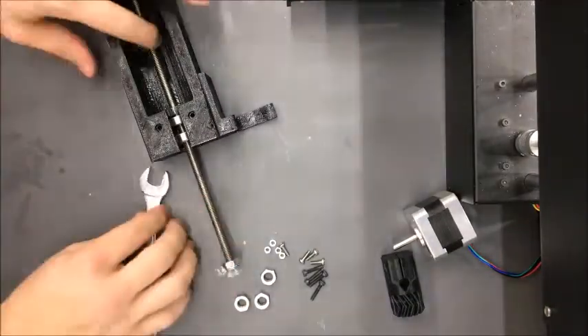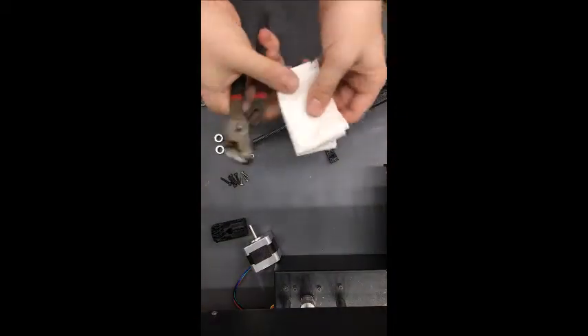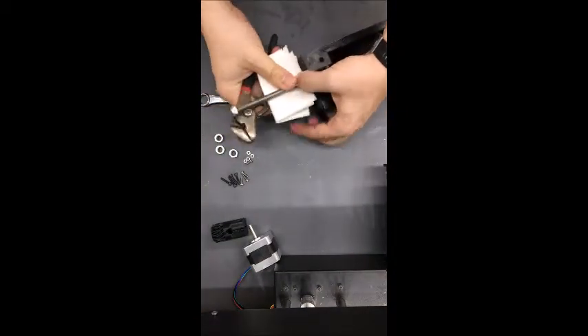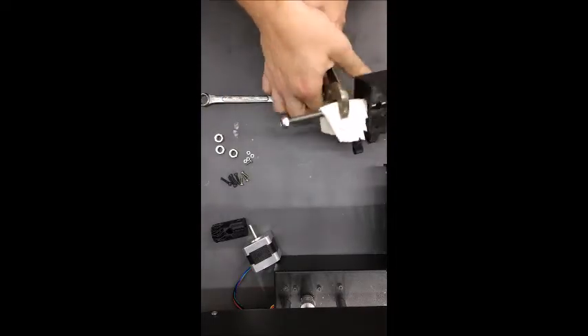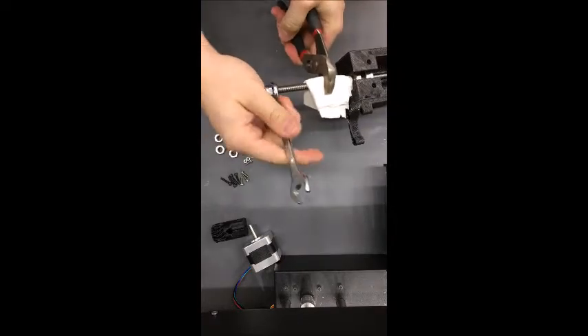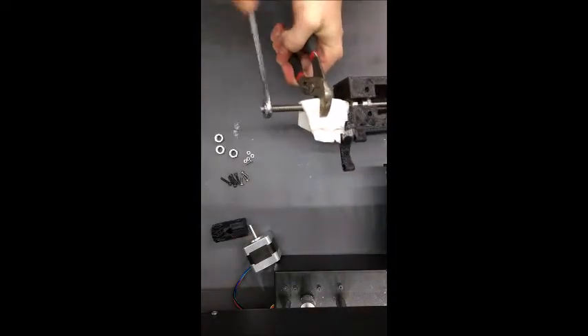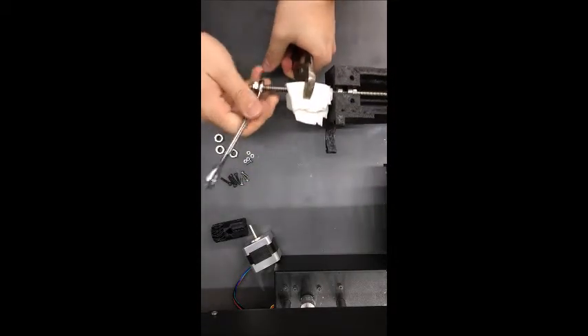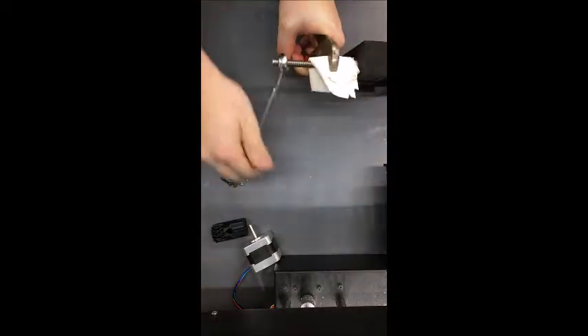One way you can do this is get a pair of pliers and a folded paper towel. Wrap the paper towel around the lead screw so you don't damage the threads, then squeeze it tight with the pliers. Then use your wrench and tighten the lock nut. It can be really difficult — you might need help from somebody else. It's pretty easy to strip the threads, but once this is on, hopefully you'll never have to take it off.